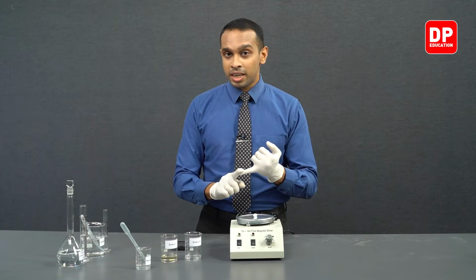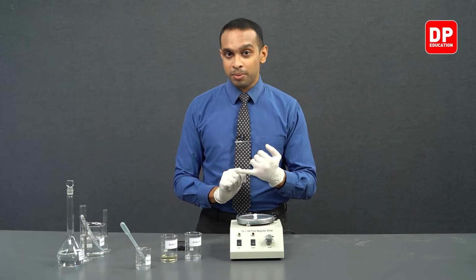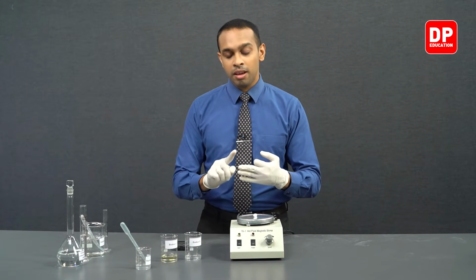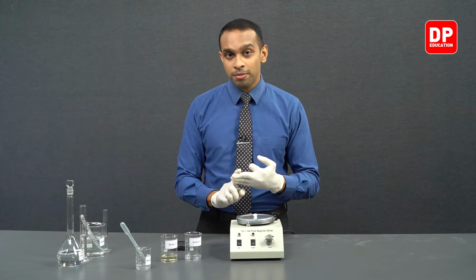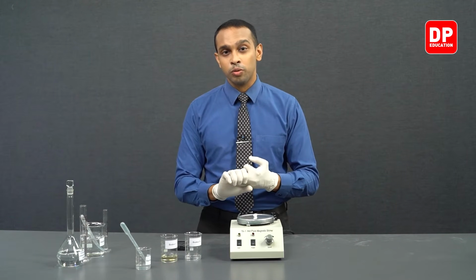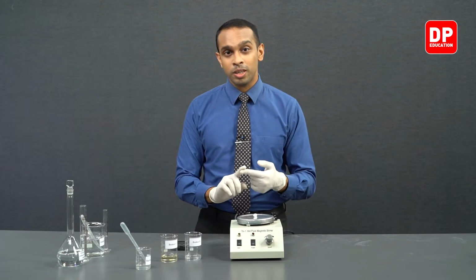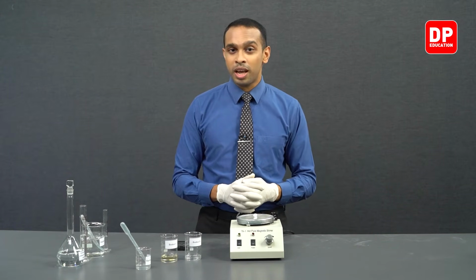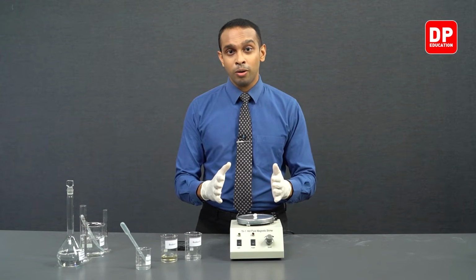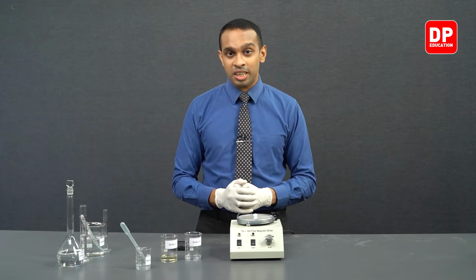So the second reaction mixture is going to consist of 10 milliliters of potassium iodide, 15 milliliters of sodium thiosulfate, and 20 milliliters of Fe3+ ion solution. So this will bring the total volume to 45 milliliters. But if you add 5 milliliters of distilled water, the overall reaction mixture will have a volume of 50 milliliters. And this also brings about the decreasing of our Fe3+ ion concentration.